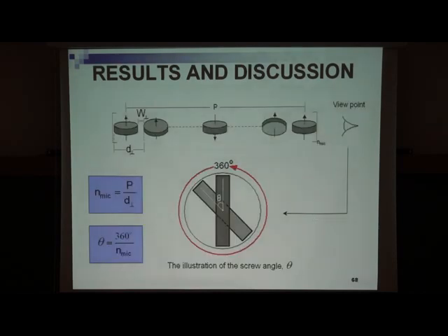Okay, now, as you know, micelles turn around to complete a 2-pi rotation along the helix axis. So we should know the screw or twist angle going from one micelle to another, and we draw this type of configuration.